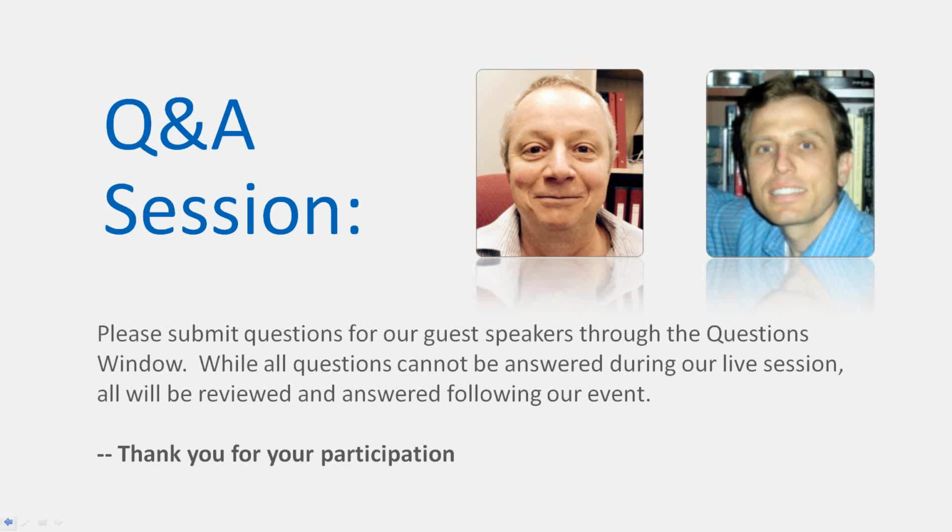Another group of questions. I'm reading through some here, and they really relate to ventilation. So maybe I can position this as: in all cases, should someone be using a ventilator, and what would the benefit be? Philip, can I direct this to you? Yeah. Well, certainly yes. Ventilation is important.